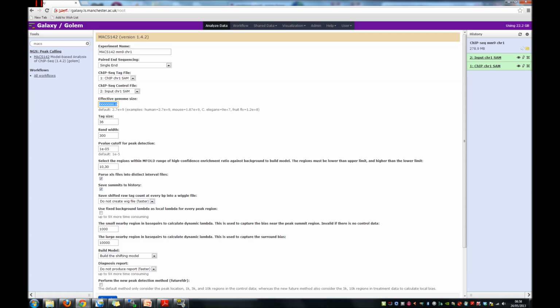So it's 187 with 7 zeros. 1, 2, 3, 4, 5, 6, 7. We can just double check by counting back along here. So it's 1, 2, 3, 1, 2, 3, 1, 2, 3, and 1 billion. So that's fine.